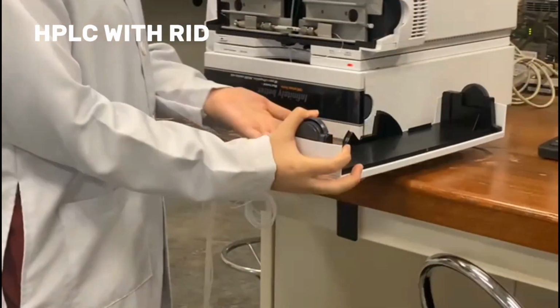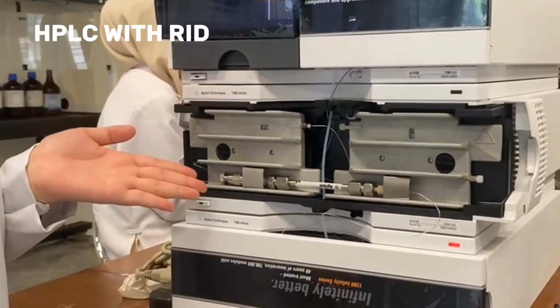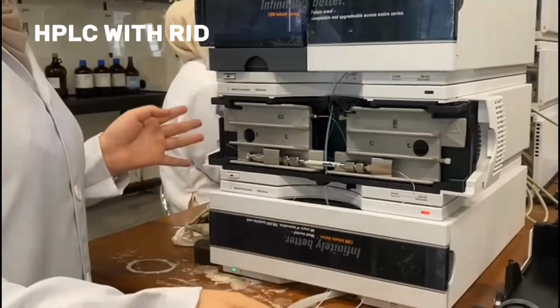The guard column is a short column placed before the analytical column. It helps maintain the integrity of the analytical column, ensuring consistent and reliable separations over time. The analytical column is the primary column, where the actual separation of sample components occurs.